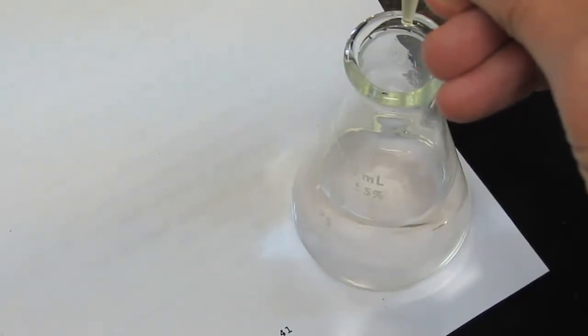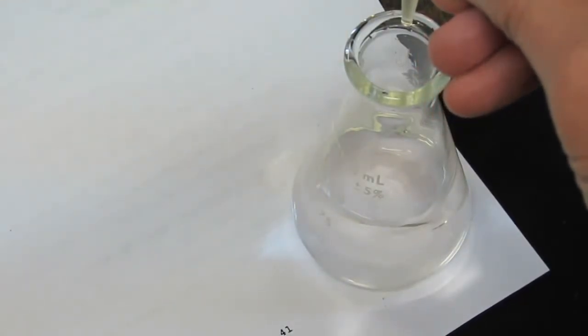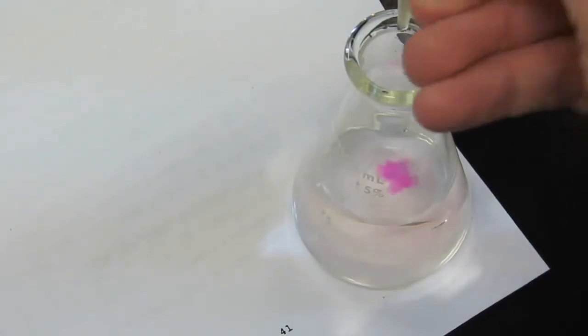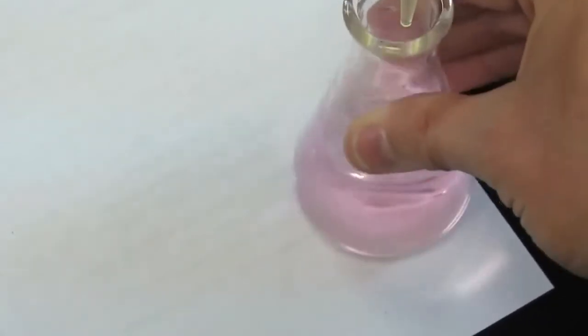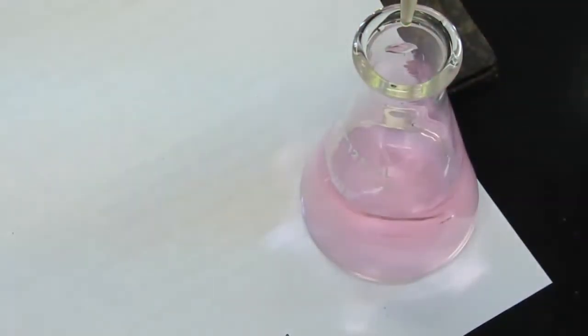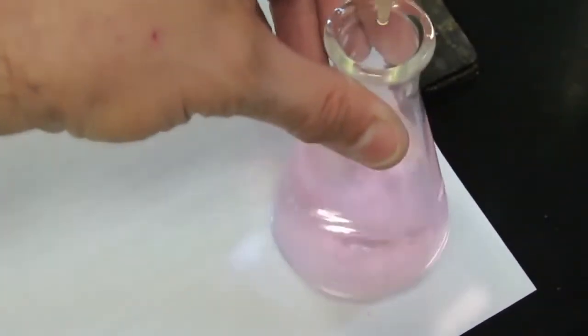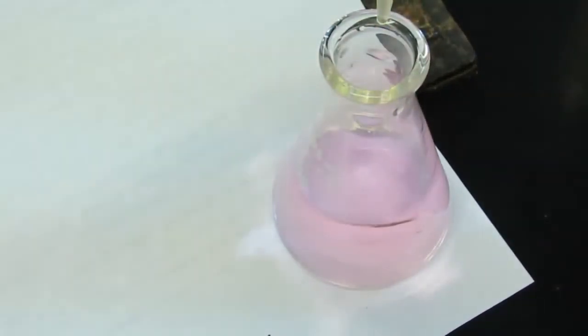So I know I'm very, very close to my endpoint. Let's see what happens here. There's my drop. And let's see. We'll swirl it. If that color stays for 30 seconds, we know that we've reached our endpoint. So, I'm pretty confident that we've done it. So we'll go ahead and take our final base reading, and then we'll take our final acid reading.